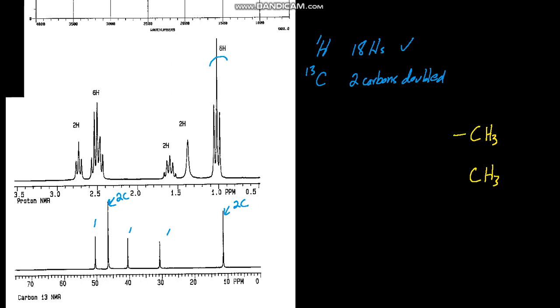So what we see then necessarily must be methyl triplets duplicated. So one signal for the methyl, split 2 additional times, methyl triplet, methyl triplet. Then there has to be a pair of CH2 signals that are identical. Well, no, we don't know they're identical. They're probably identical.